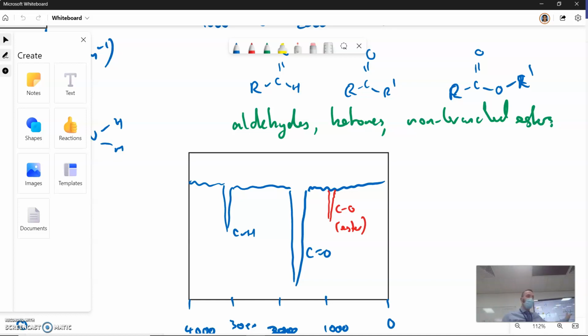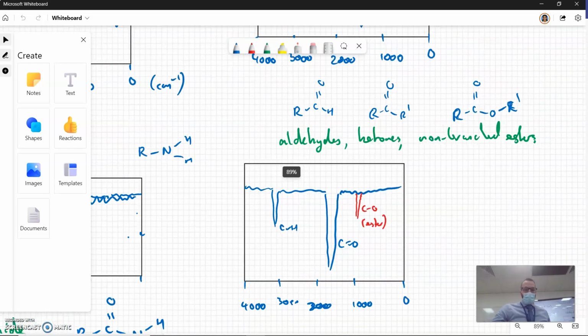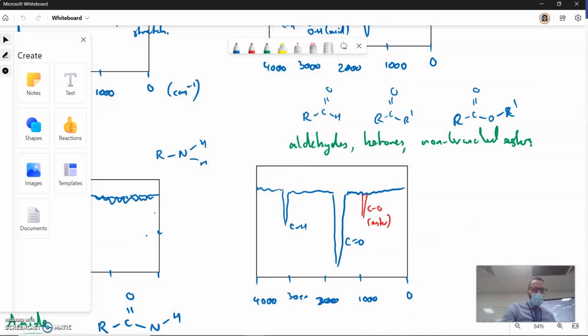In this case, we go, oh, that might be a ketone, or it might be an aldehyde. Now I'm going to look at the mass spec, or the NMR, to deduce what that actually will look like. When we start to look at NMR next week, you can get a lot of information from NMR, proton NMR in particular. All right. So any questions on that?